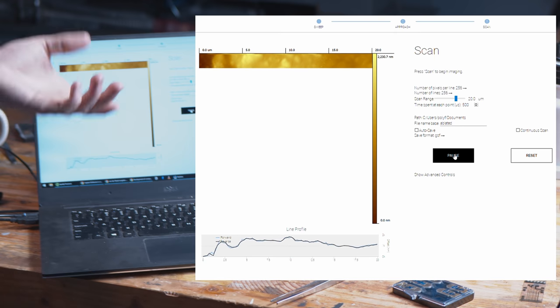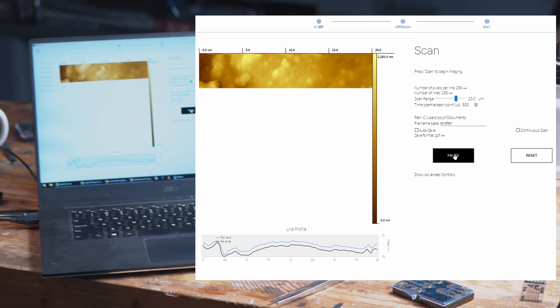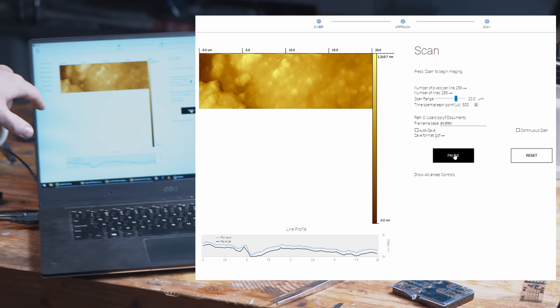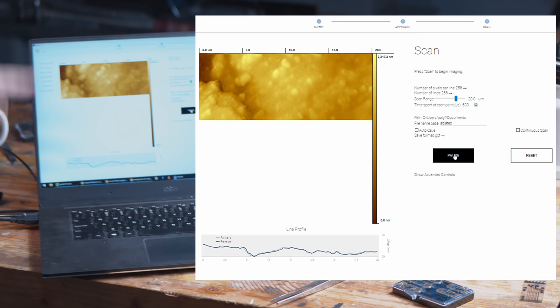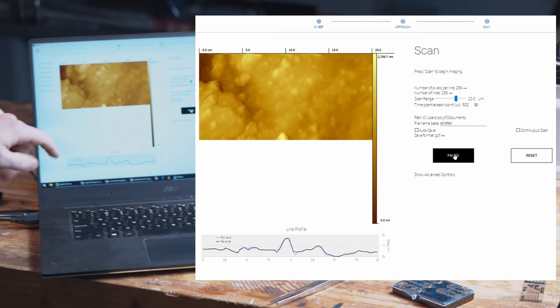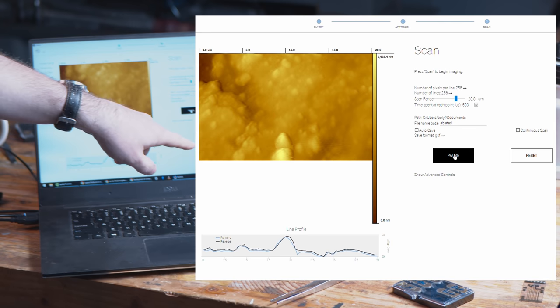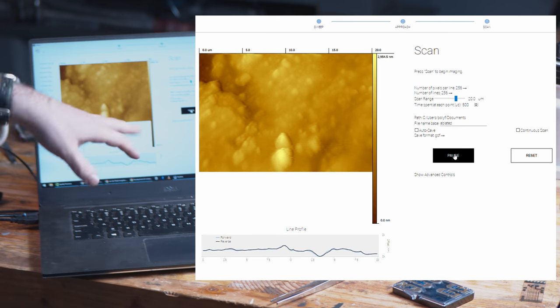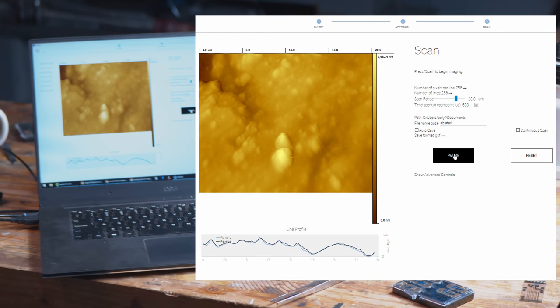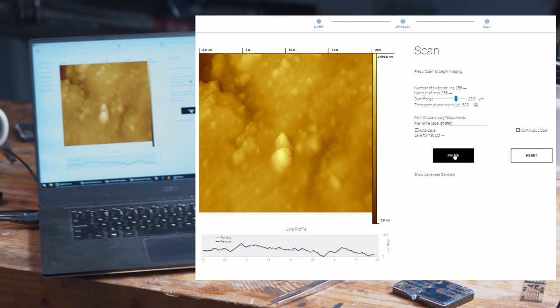I'm not overly familiar with what tungsten carbide looks like under an AFM — it is a sintered material, so you kind of expect it to be glumpy with big particles. If you look at the data coming in, we've got 2.3 microns between the lowest point and the highest point, with the low moments over here and the high points at the top of these particles. The line profile shows the Z height of the most recently scanned line, and there are two lines showing the forward scan and the reverse scan — ideally you want those to match up because that confirms the PI controller is working correctly.